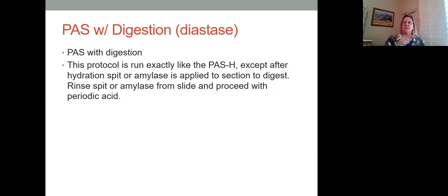The difference comes in the very beginning of the protocol. After you have deparaffinized and hydrated, or after you have fixed and gone through water wash with the frozen, you need to put a digestion enzyme on the slide.